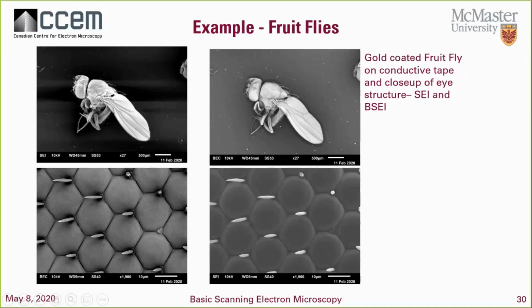So you could do things like maybe staining it instead, or use a coating machine which can tilt the sample so we can maybe get some side coating and make a path. You could also possibly use some paste to join up the top of the sample to the holder or your substrate. Or you can adjust the parameters, or go to environmental or low vacuum.